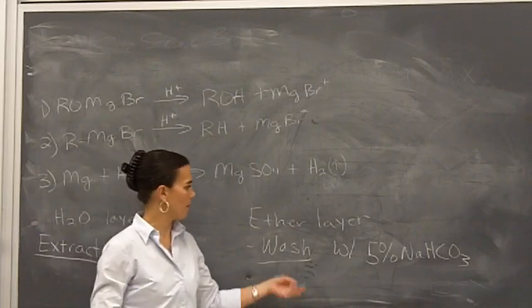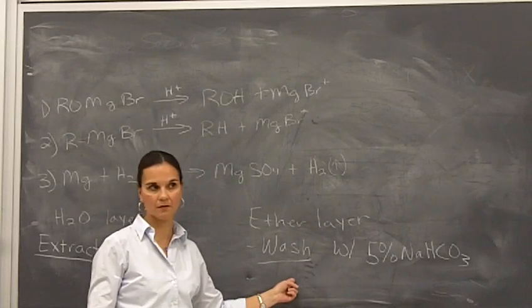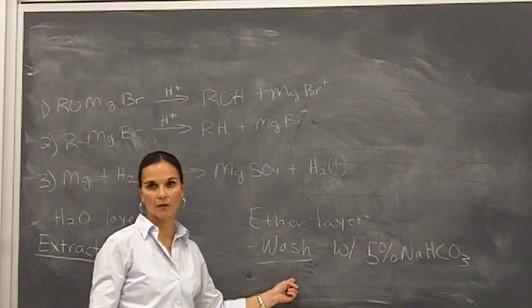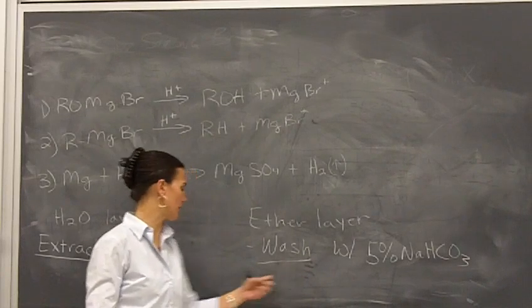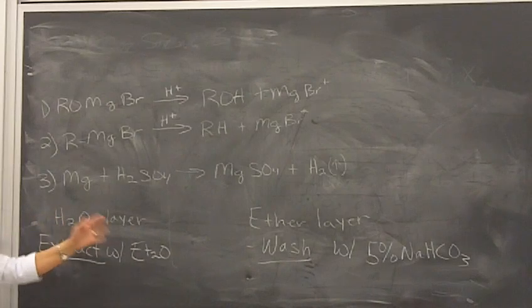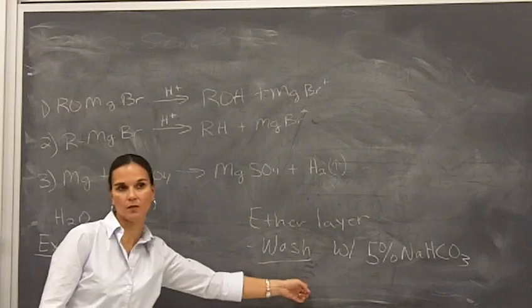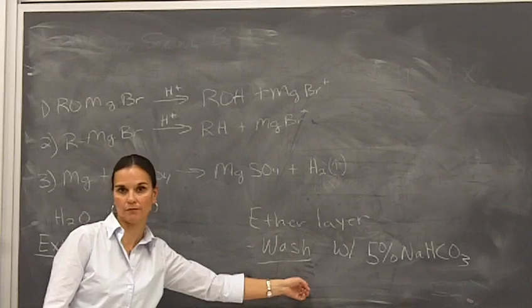Take the stopper off, drain off the aqueous layer. That's all of what wash means, okay? So all those steps are involved in either one of these, all right? And from here on out, whenever we're doing a workup, if we say extract, we mean what I just told you meant for extract, or if we say wash, it's what I just went through for wash, okay?